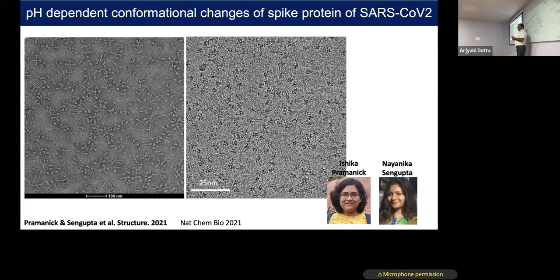Stacking is there in both cases. In one case we are using staining solution, a heavy metal staining solution. Here we are not using anything; here it is in buffer. If you consider buffer or water, your protein molecule is more dense than your buffer.